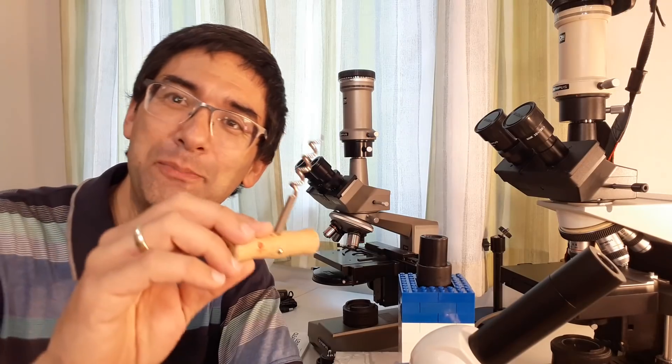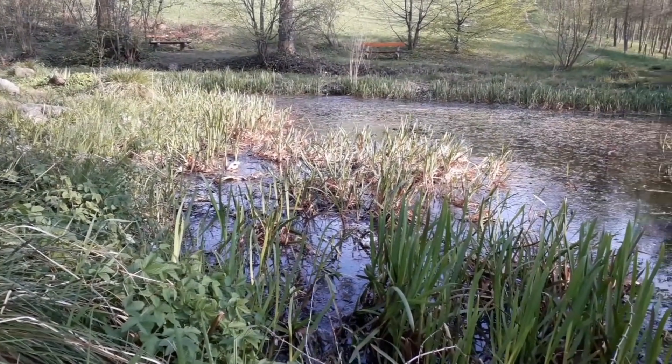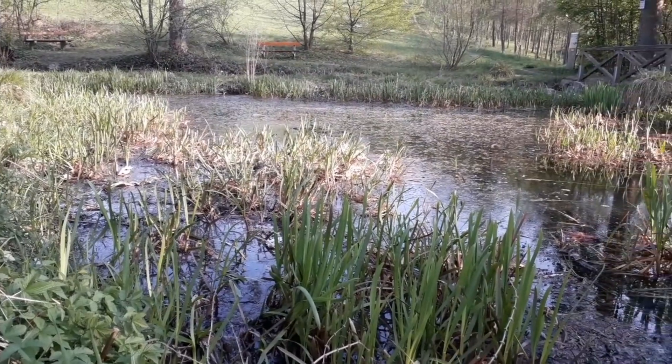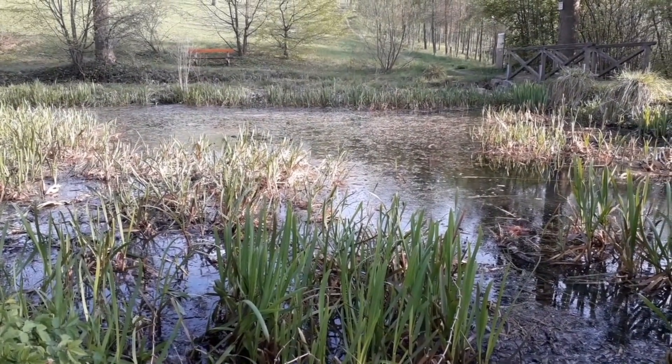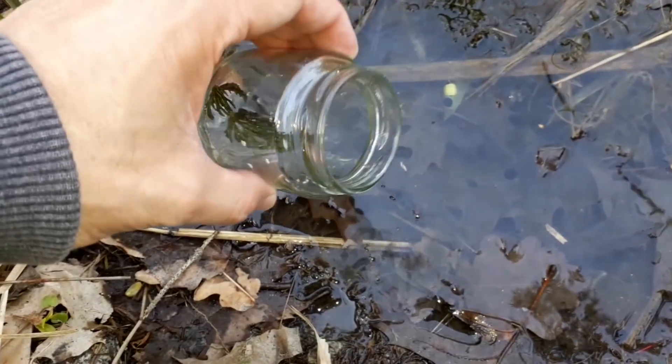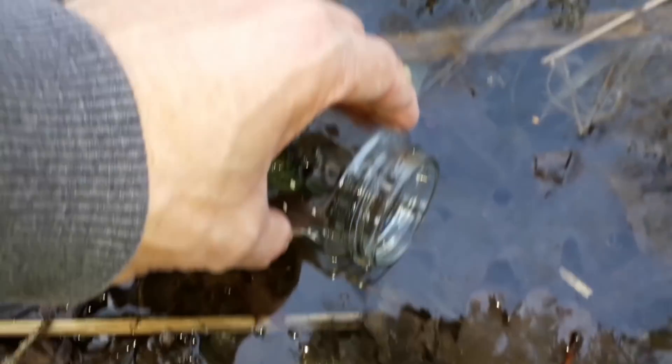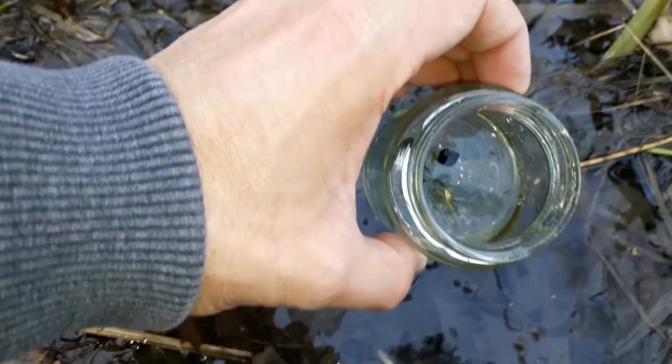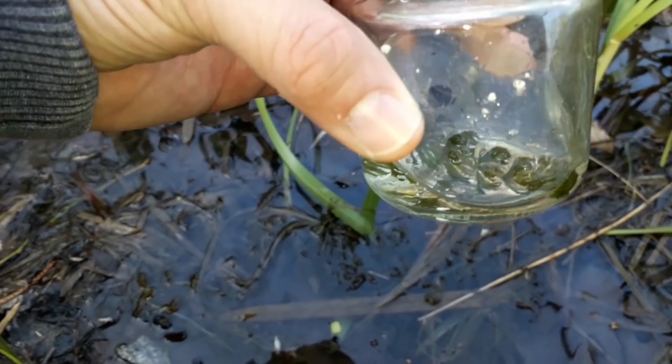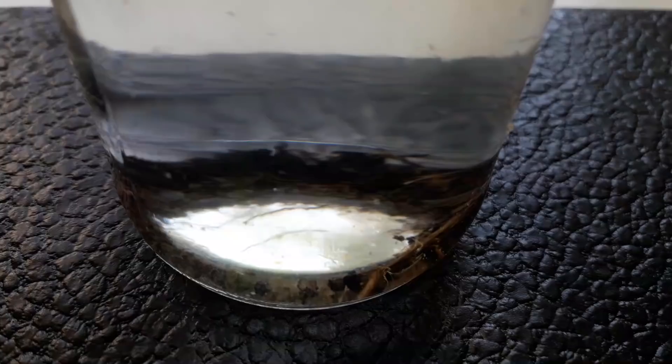But now let's go back to the spirilla. This here is my favorite pond. It was in early springtime, so there aren't yet all too many plants growing. The plants are still a little bit short, so the pond is easily accessible. And I simply picked up a water sample from the surface of the water. And I took it home and I put the water fleas that I caught this way directly under the microscope to do some simple pond water observation.